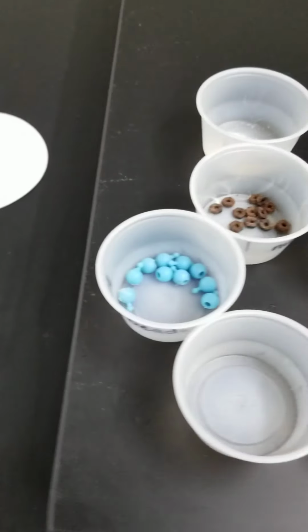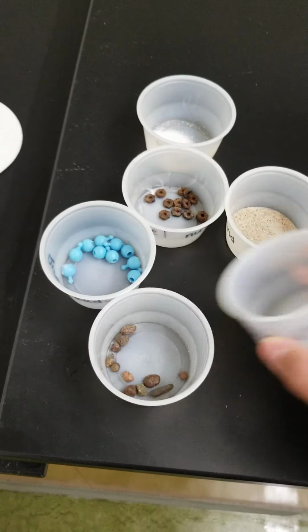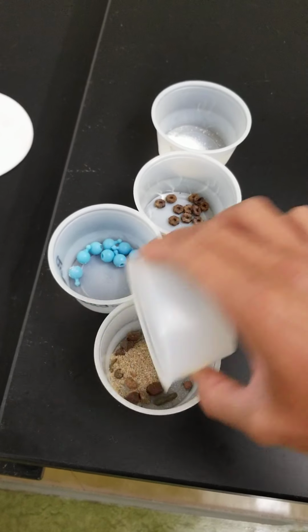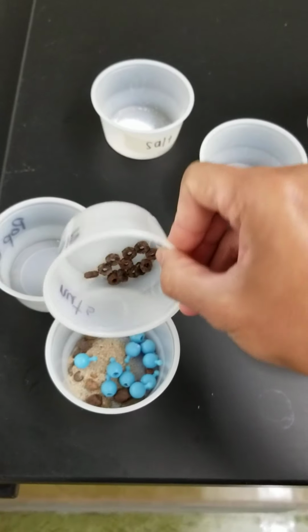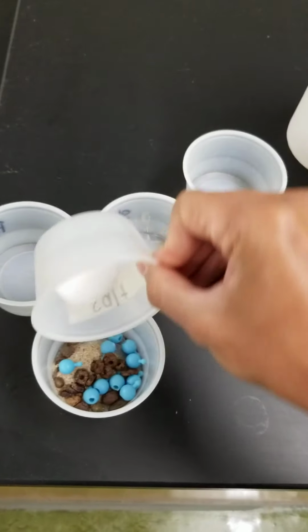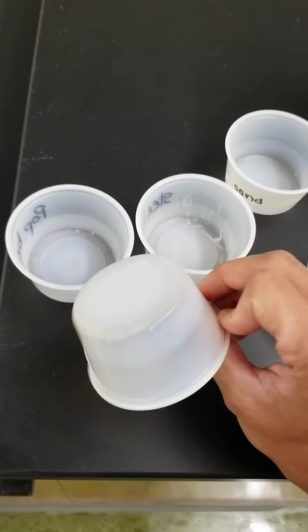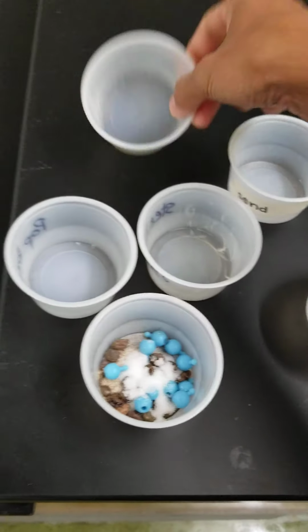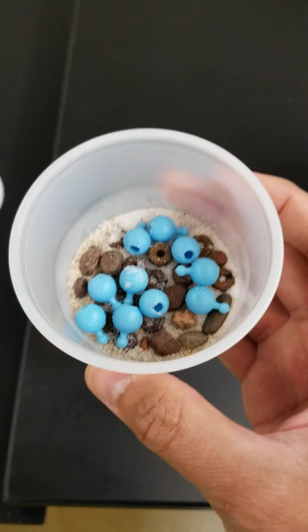All right, so now I have all of the pre-measurements, and we're now at a point where we could mix all of this. So it's a pretty simple task. So let me just start dumping everything. Make sure I got most of that, especially the salt. Mix it well. All right, so here's what we have.